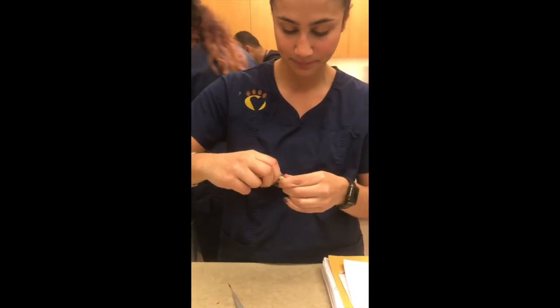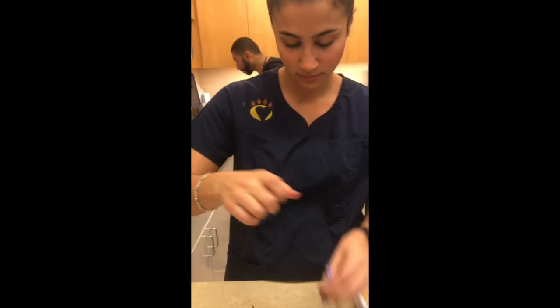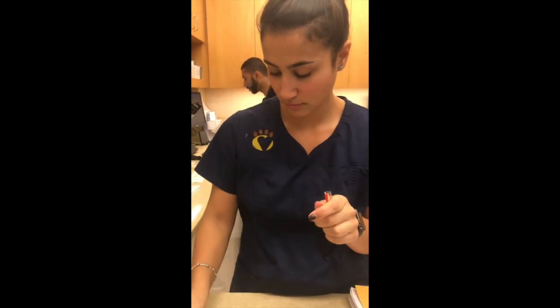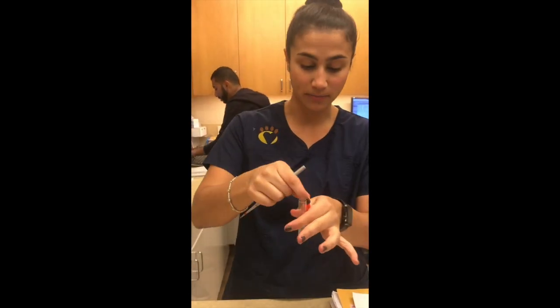Decant the plasma. So I'm just being careful not to invert it too much because I don't want the plasma mixed up with the blood.